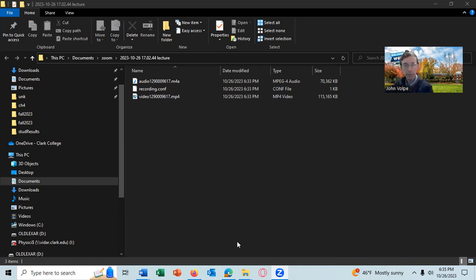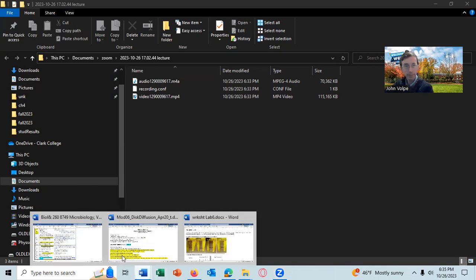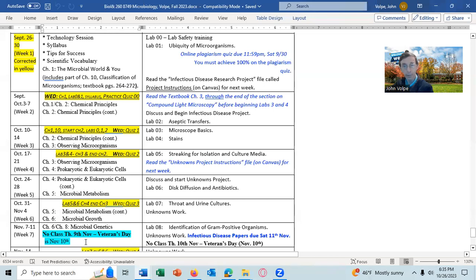So we're going to be doing lab 6 today, disc diffusion and antibiotics.